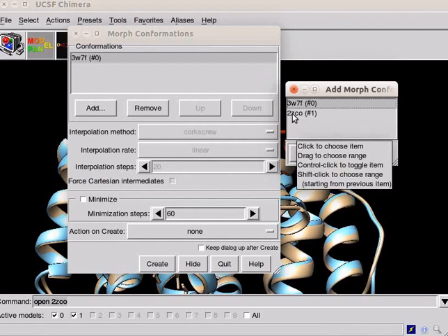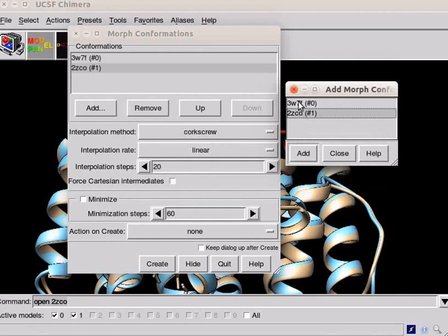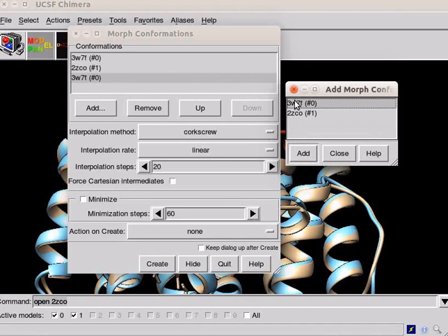Next, click on model number 1 that is 2ZCO. Then again click on 3W7F that is model number 0.